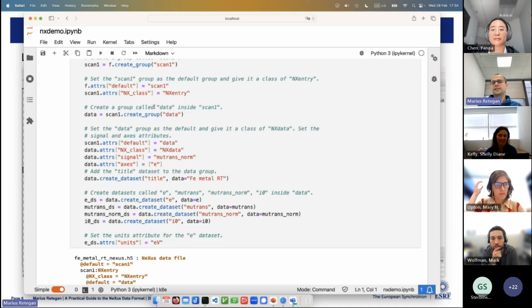So yes, in principle, Silex has this possibility to read NX data. Silex does not have the capabilities to read, like we have for NX Tomo, for example. You cannot read NX data formatted in a different application, so you would have to implement that in your code.